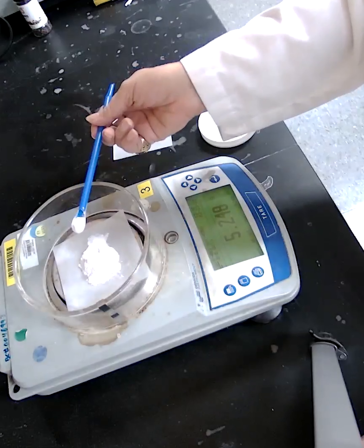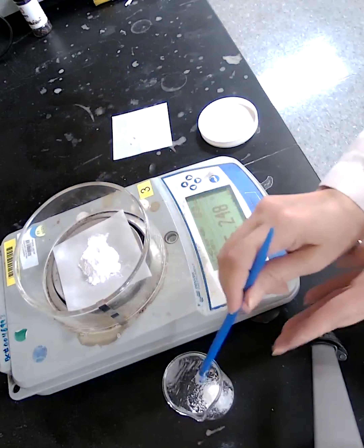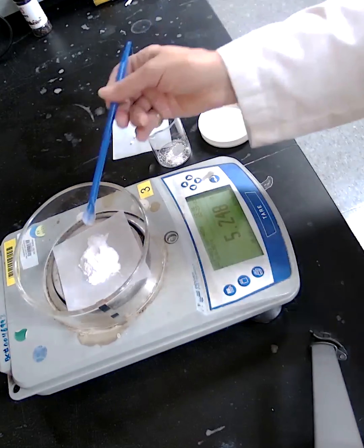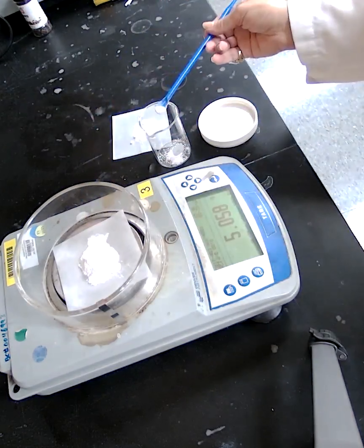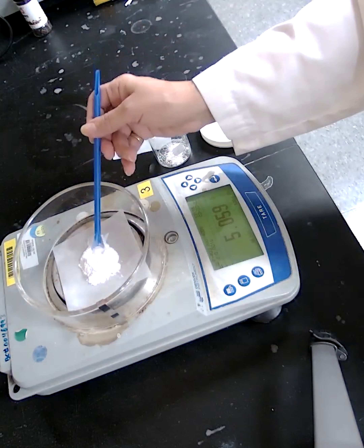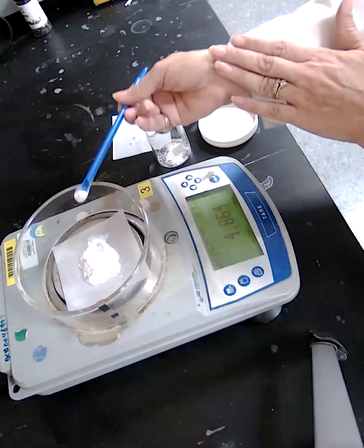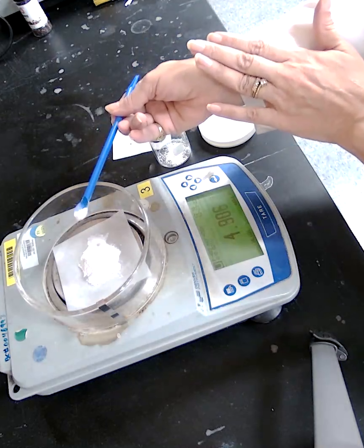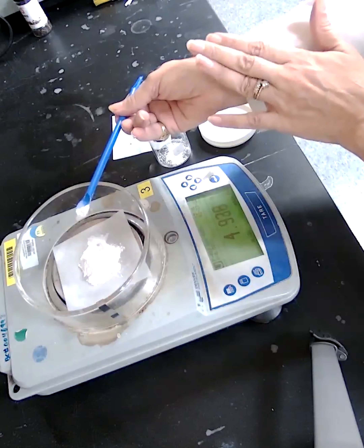If you have added more than enough, do not return the excess to the original container. Instead, drop it into a designated waste container. Then add slowly to reach the 5.00 gram target and stop there.